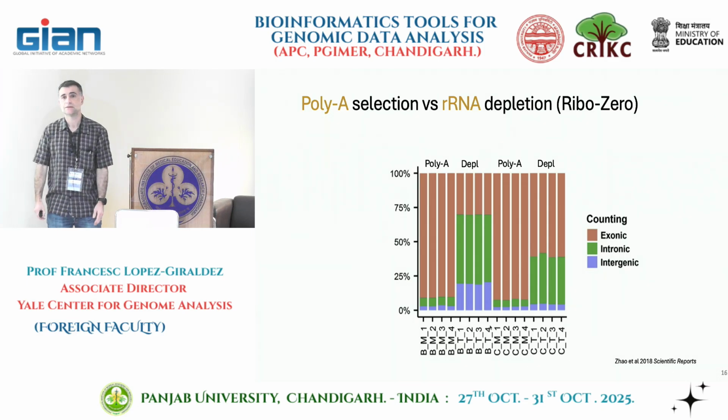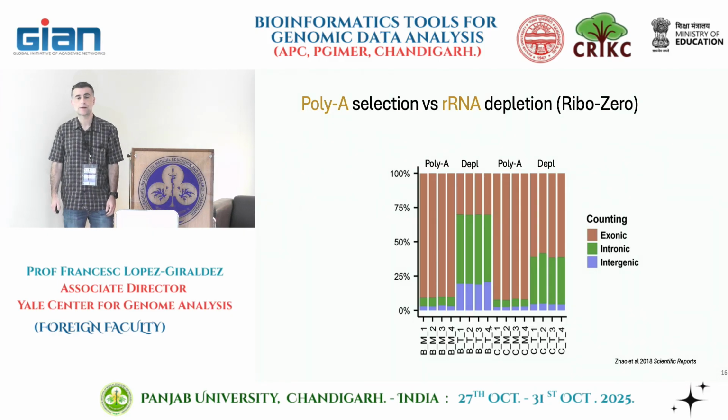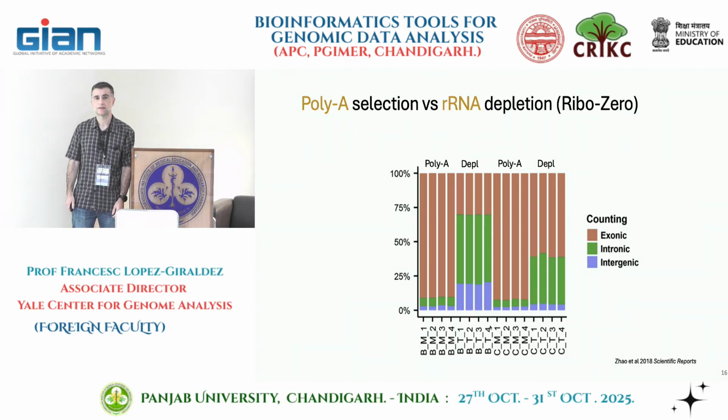Is ribodepletion better than poly-A for formalin fixed samples? Always ribodepletion for formalin fixed, because it's already fragmented RNA and poly-A will be inappropriate.